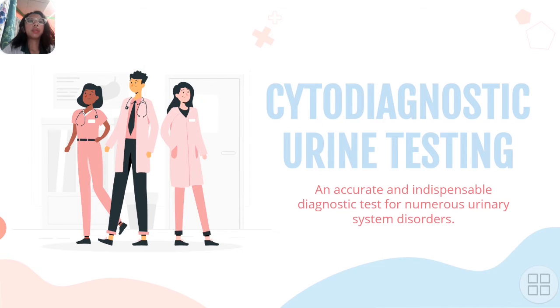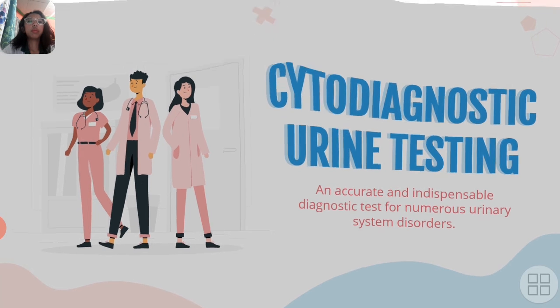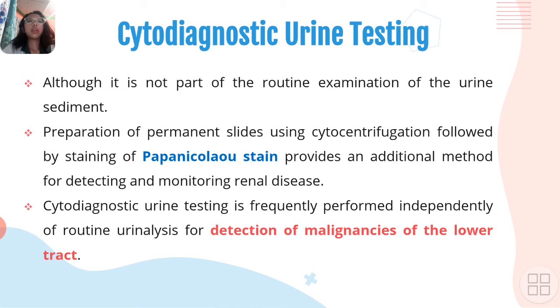Cytodiagnostic urine testing. It is an accurate and indispensable diagnostic test for numerous urinary system disorders. Although it is not part of routine examination of the urine sediment, preparation of a permanent slide using cytocentrifugation followed by staining with Papanicolaou stain provides an additional method for detection and monitoring of renal disease. Cytodiagnostic urine testing is frequently performed independently of routine urinalysis for detection of malignancies of the lower tract.